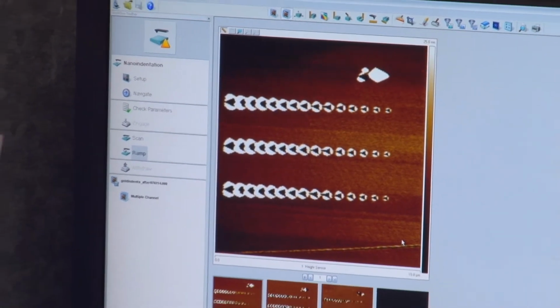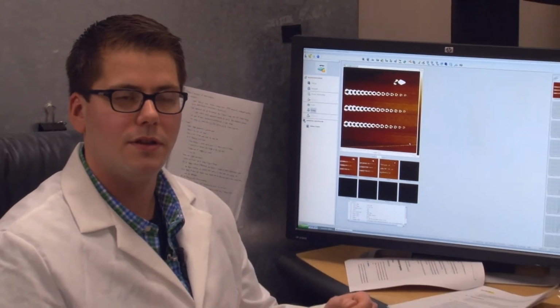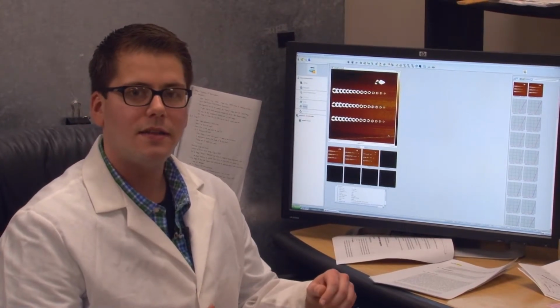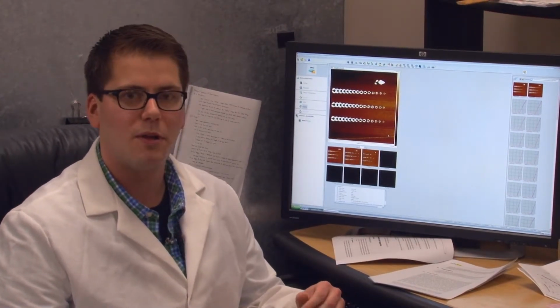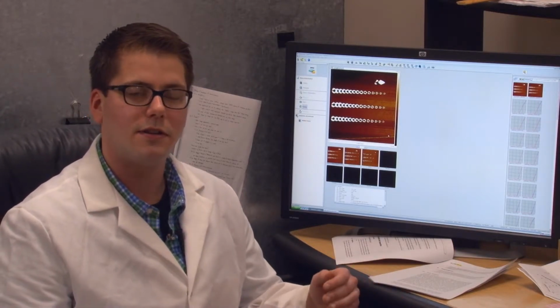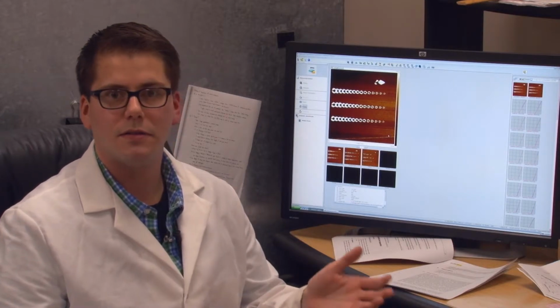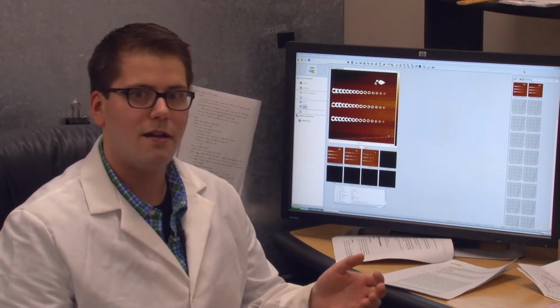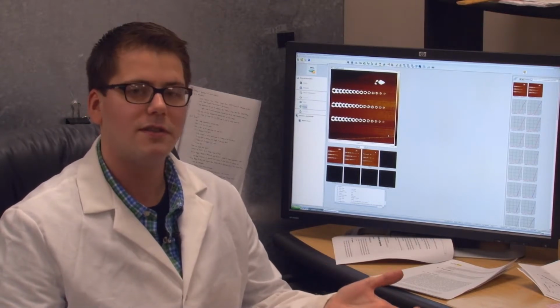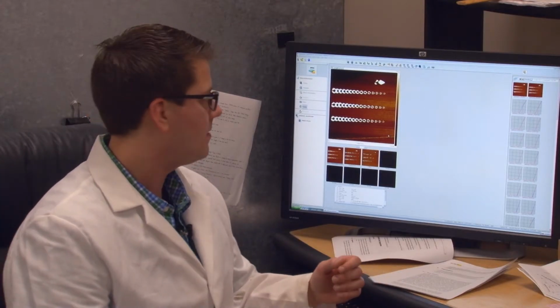We increase the force by increasing the trigger threshold that is used to control the degree by which the cantilever impacts the surface. That trigger threshold can be multiplied by the deflection sensitivity that we calculated earlier in order to determine that penetration depth. In the equation F equals Kx, we now have a relationship between the spring constant and the force that was applied, and so we can calculate the applied force for each indent.